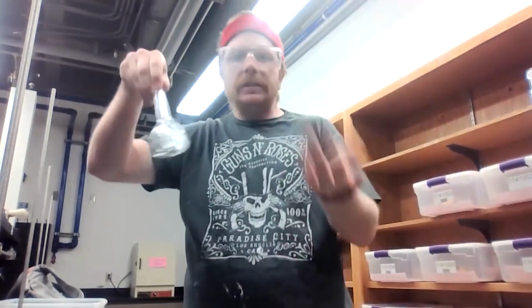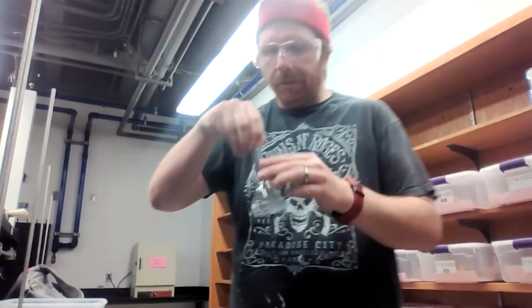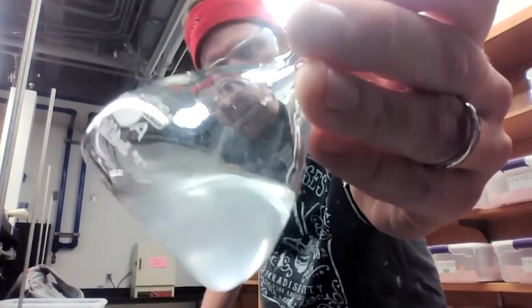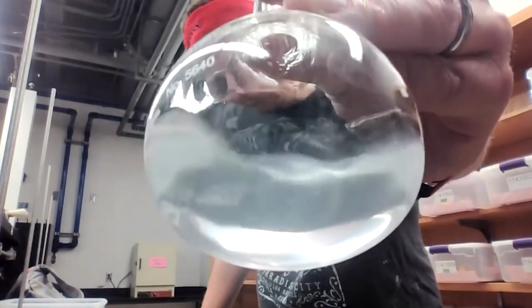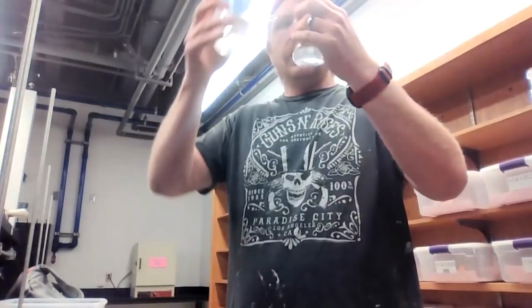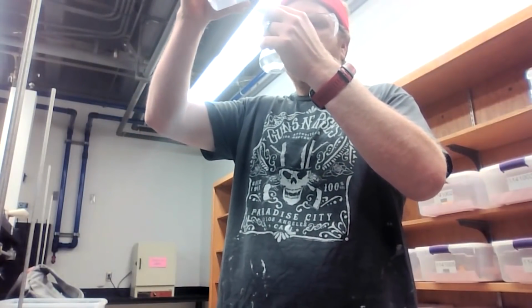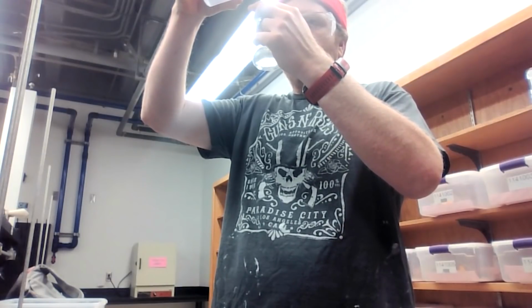That's great. What does that tell you? That tells you that sodium chloride is a soluble ionic compound. Great. Oh yeah, there we go. It's cloudy certainly, but do you see those large kind of chunks of salt? No, I don't. So now what I'm going to do is I'm going to very carefully continue adding water.